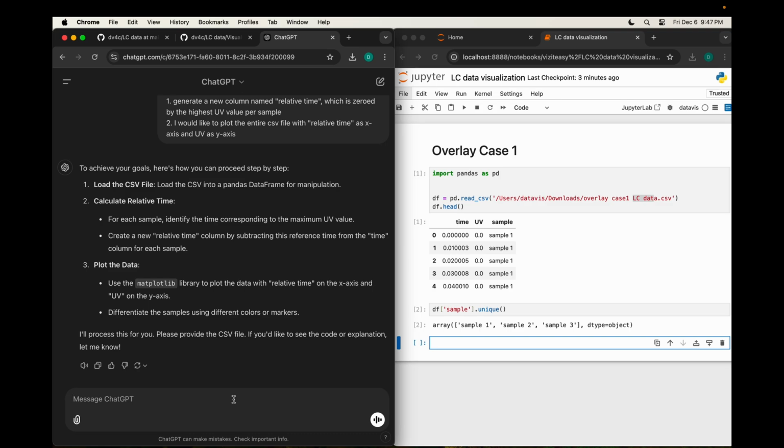Okay, actually, I think this is the paid version of ChatGPT. It can generate a plot for us, but we will probably be more interested in the code. So let's do that. And I already wrote this CSV file as a data frame with the name of df.